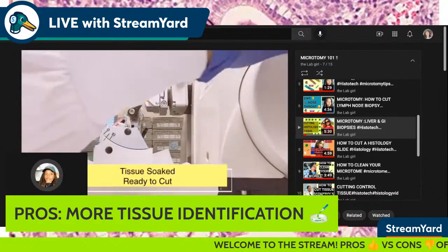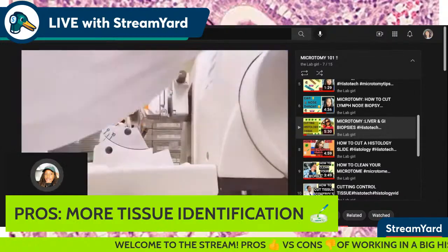We're going to go ahead and go to another video that I did cutting a different kind of tissue.